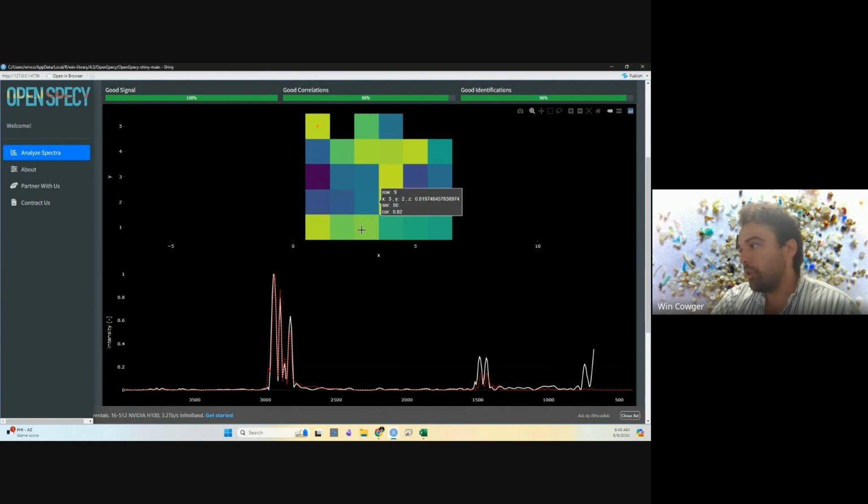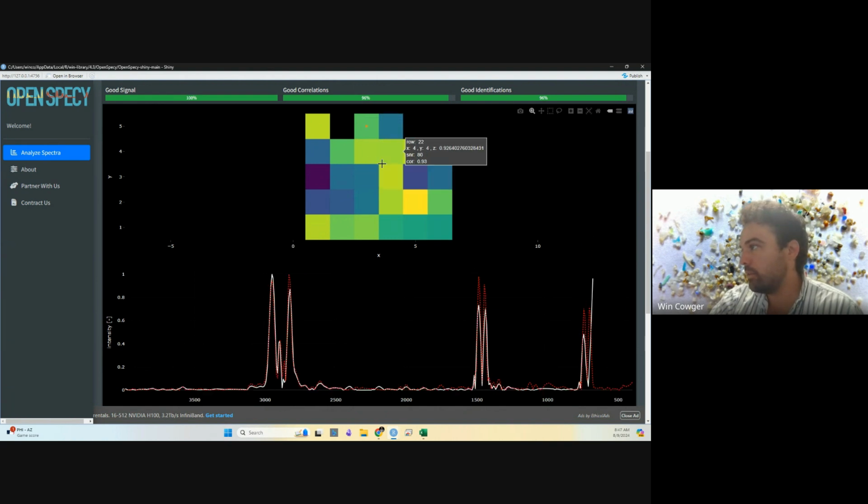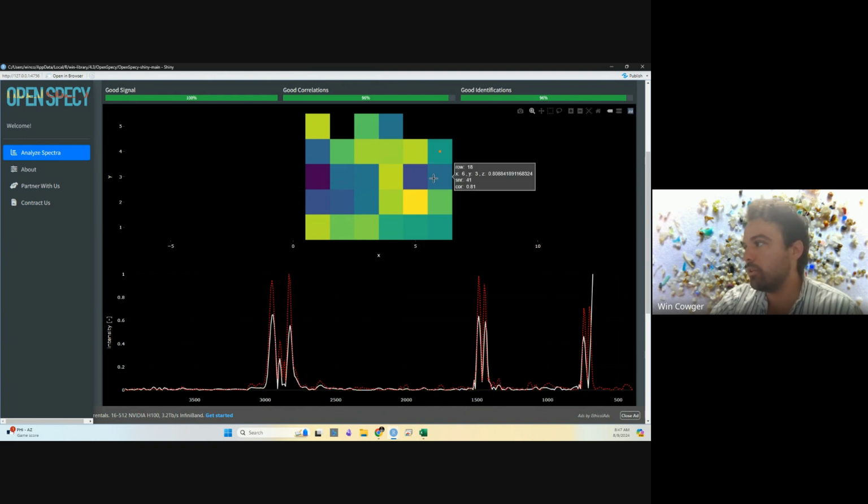One thing you could do is say, all right, I'm going to visually QC every spectrum. So I'd go through and say, look at that one, looks good. Looks bad. Okay, I'm going to flag that one. Row 26, flagging that one. I just write it down or add it into a spreadsheet. Okay, 27, looks good. Looks good. Looks good. And you can see how fast this goes. Even doing a manual QC of your spectra in batch mode is super fast.